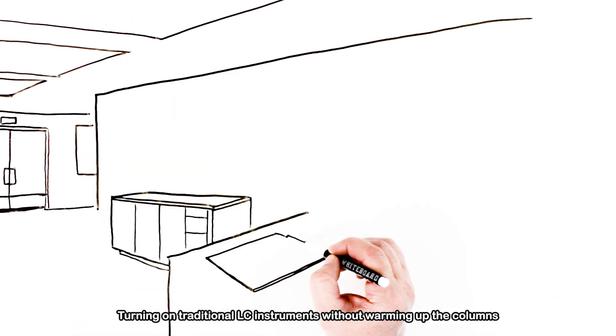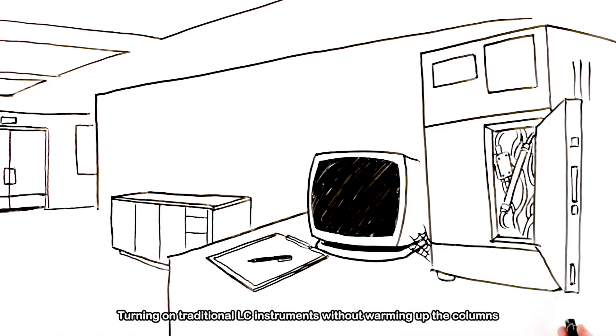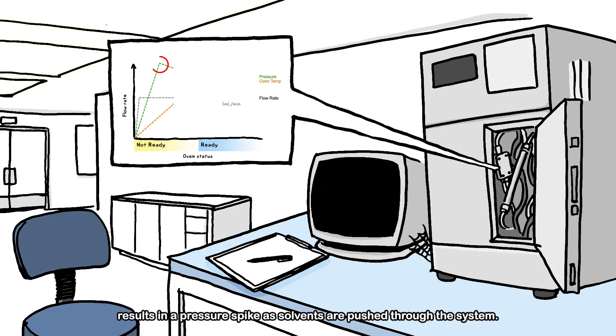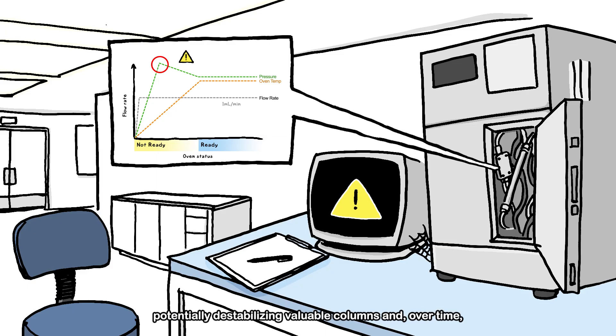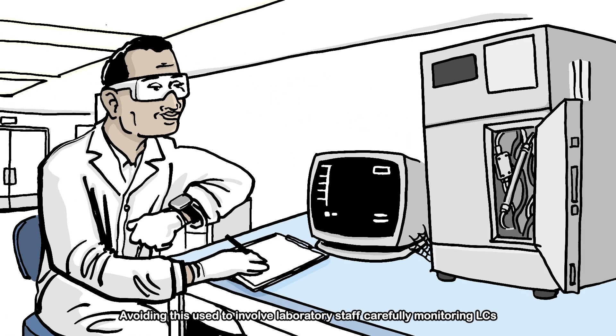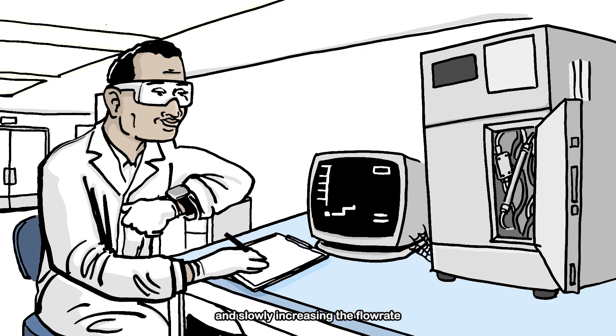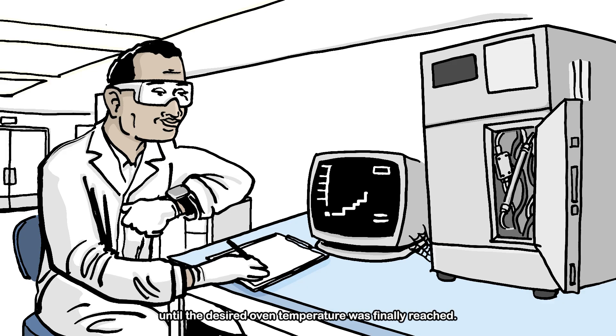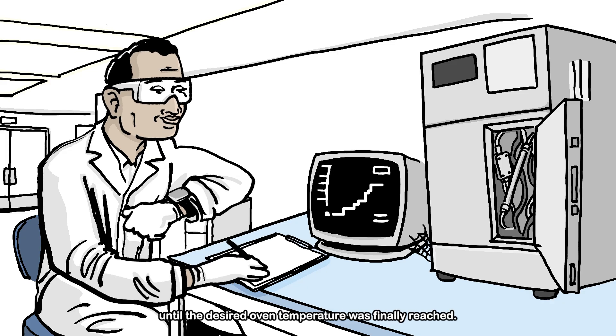Turning on traditional LC instruments without warming up the columns results in a pressure spike as solvents are pushed through the system. This can lead to pressure shock, potentially destabilizing valuable columns and, over time, lowering data quality and shortening the column life. Avoiding this used to involve laboratory staff carefully monitoring LCs and slowly increasing the flow rate until the desired oven temperature was finally reached.